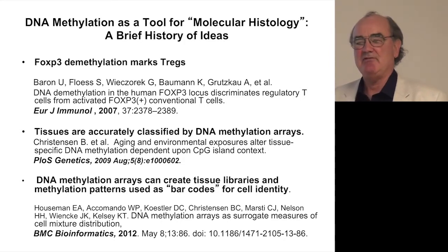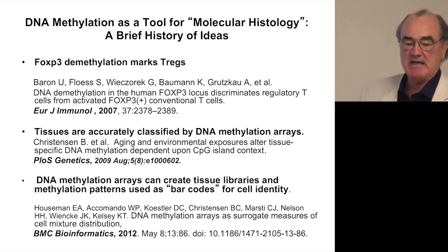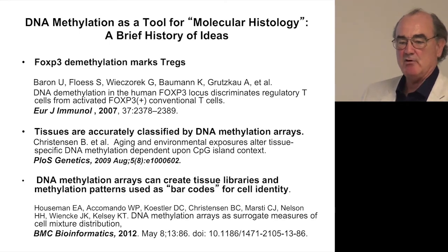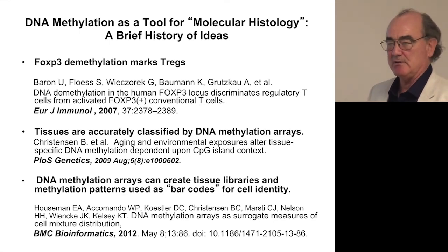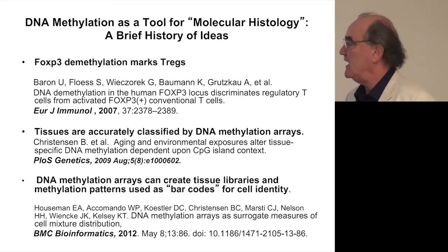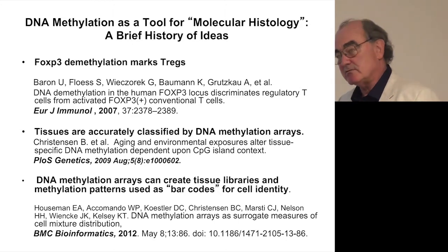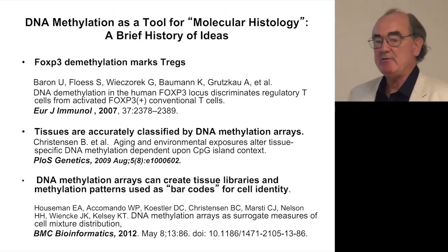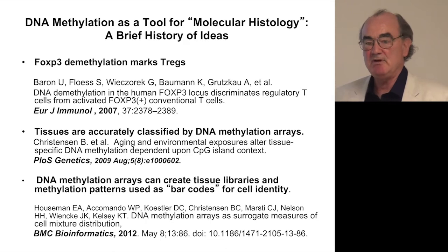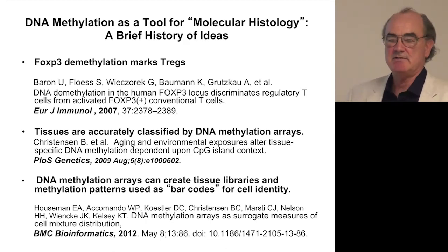And so now you can kind of see where I'm going. We've got those archive samples with all that DNA that we've been saving for so many years. We may be able to go count, using this principle, the numbers of methylated and unmethylated target genes that describe different immune cells, and we might be able to profile the immune system just using DNA. No proteins, no cell surfaces, no intact cells, just DNA.